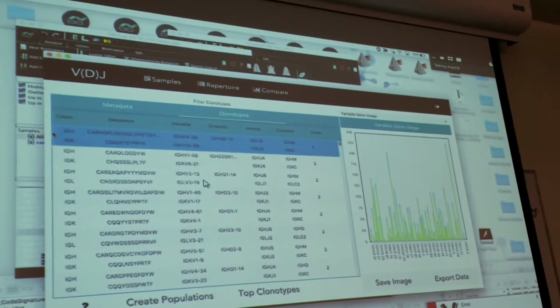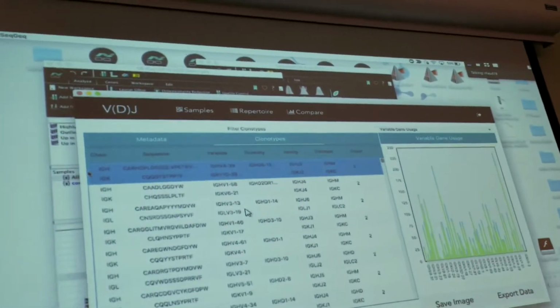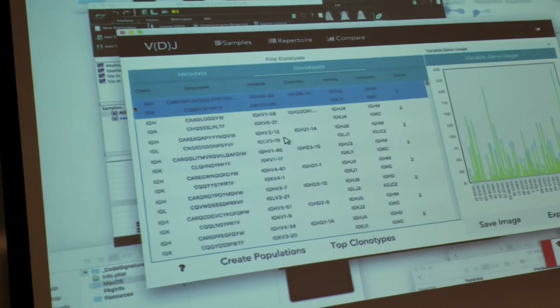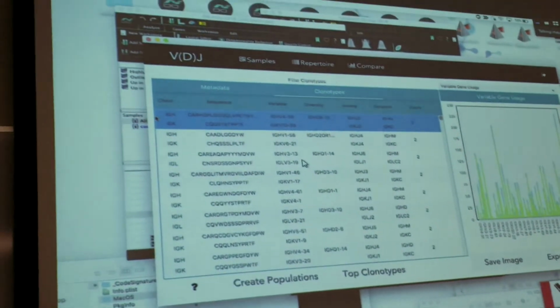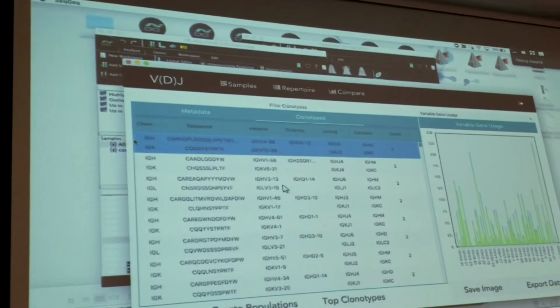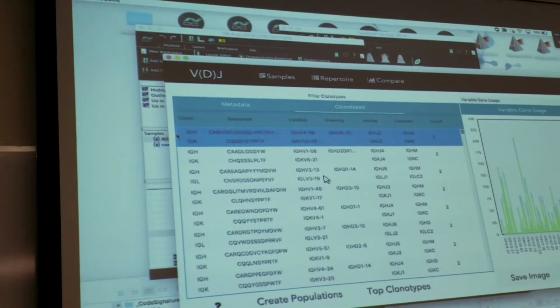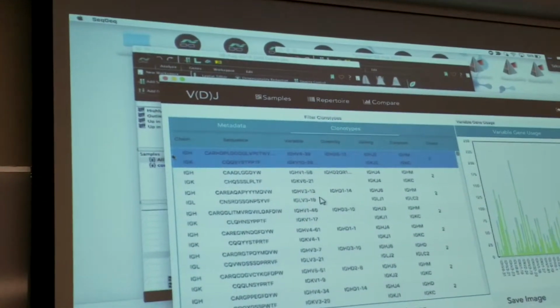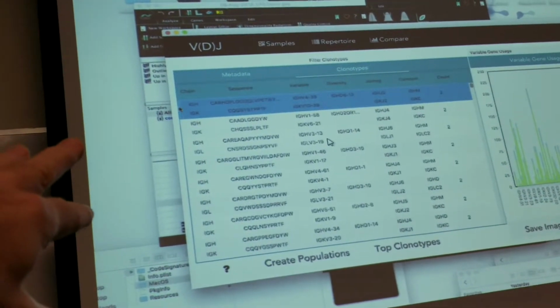In fact, you know what would be very interesting for us? If we could get a CSV file for that and then export it and show it in ClustViz, for example. So it's a heat map of all those things, and then they're clustered together by some method. I asked, that was one of the questions, how do I export something like this into ClustViz? If it's possible. Or not ClustViz, a CSV file of this.